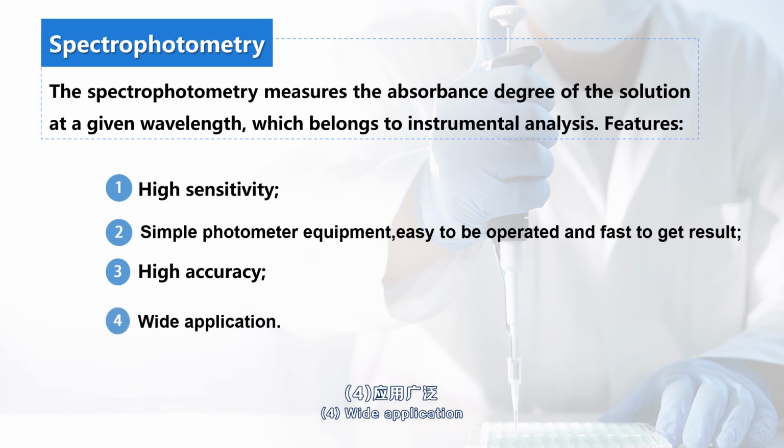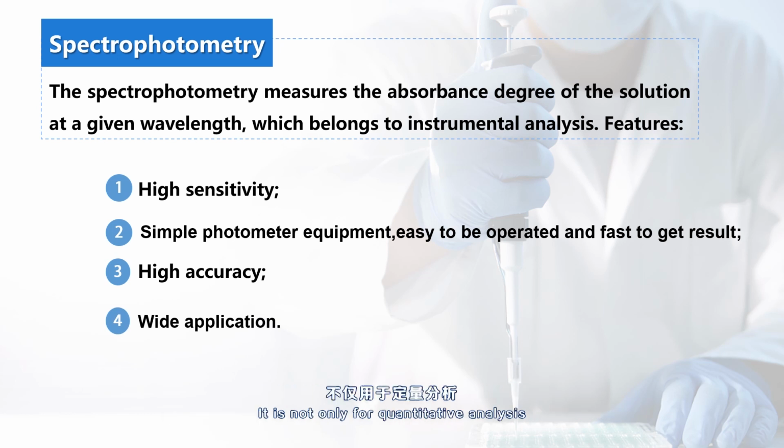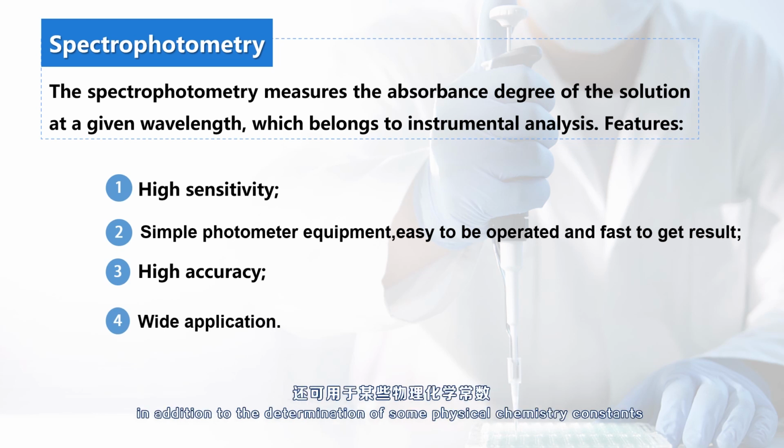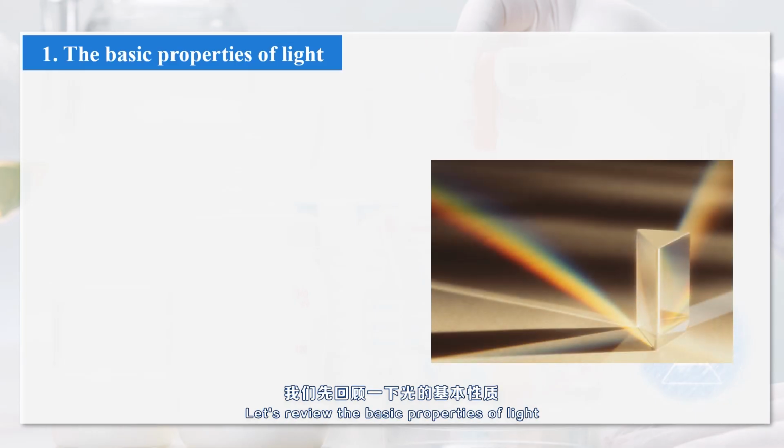Fourth, wide application. Most inorganic ions and organic compounds can be determined. It is not only for quantitative analysis, but also for qualitative analysis of certain organic compounds, in addition to the determination of some physicochemical constants and the composition of complexes.